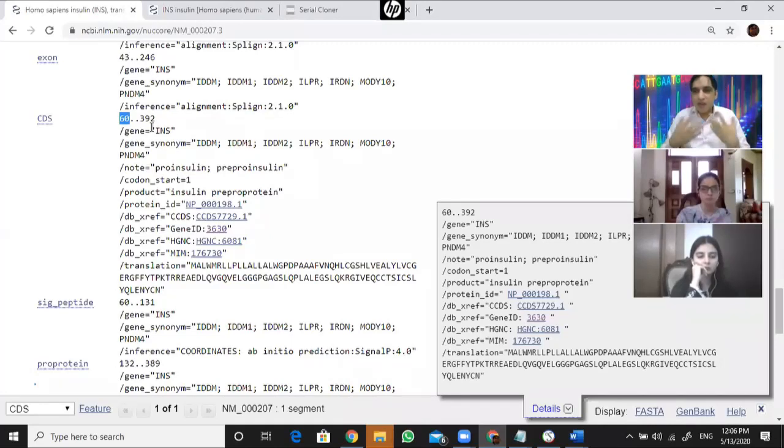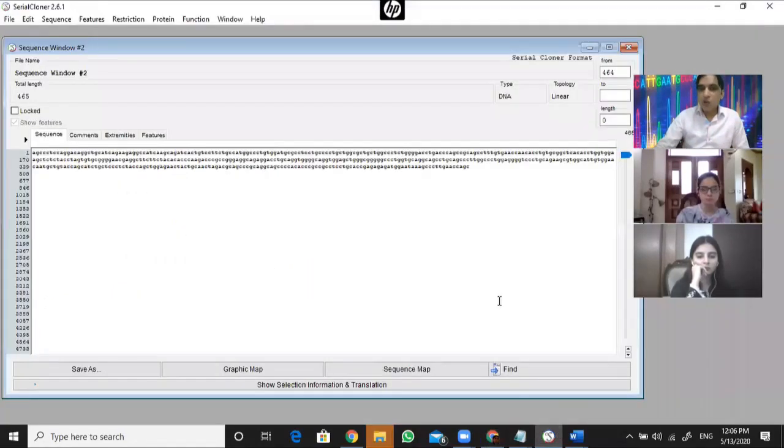Since I am developing my own file, because I need to explain to my professor every now and then, and I need to share things with the other students as well, I should have my own file with my own things. So I want to highlight that portion in that sequence.